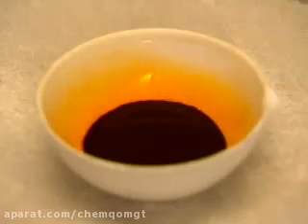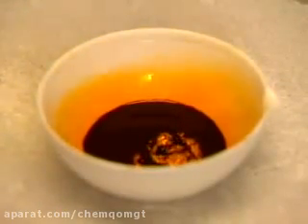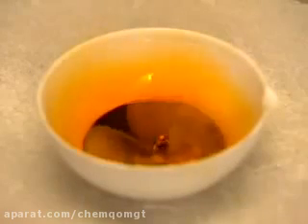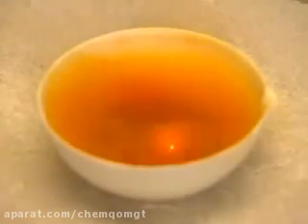The white fumes are aluminium trichloride. With bromine, I just drop aluminium foil into the liquid. There's a short delay, but normal service is soon resumed. Once the reaction gets going, it quickly takes on the appearance of the pit of hell. As with the chlorine reaction, there's white smoke. That's aluminium tribromide.